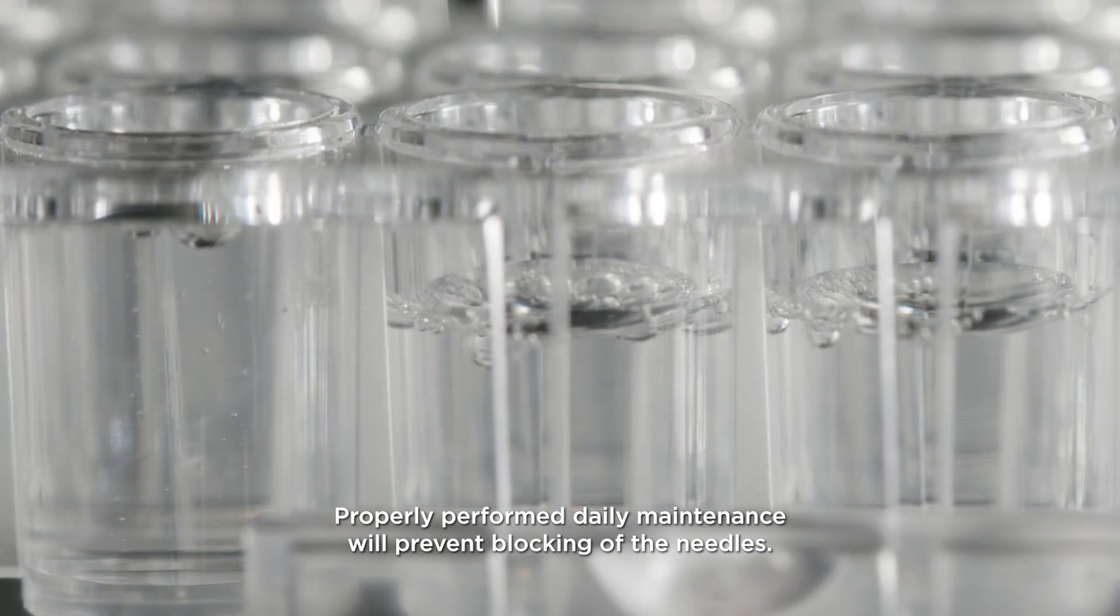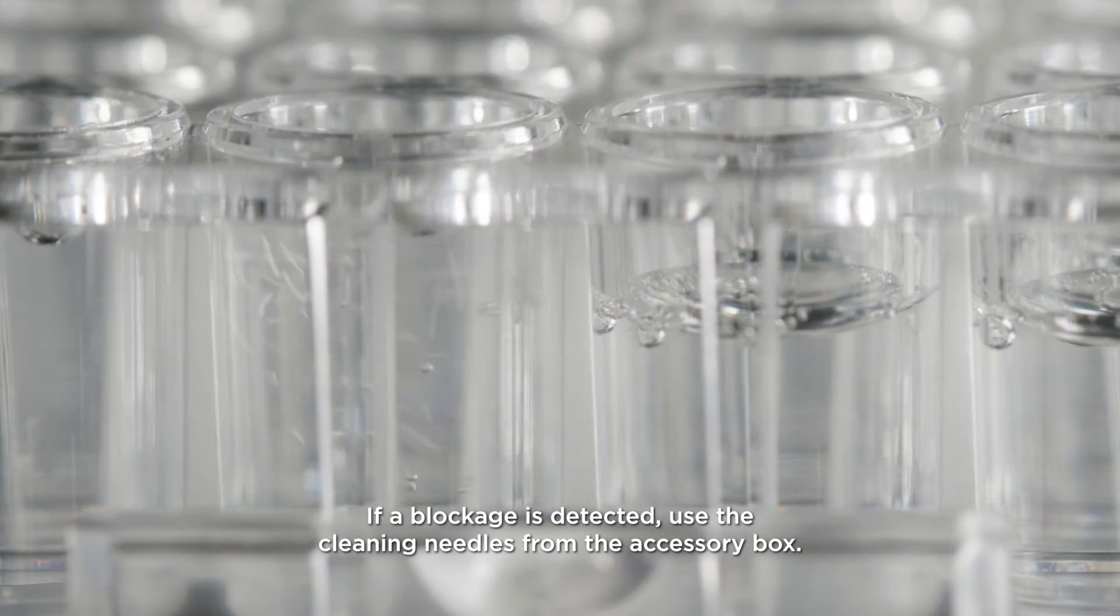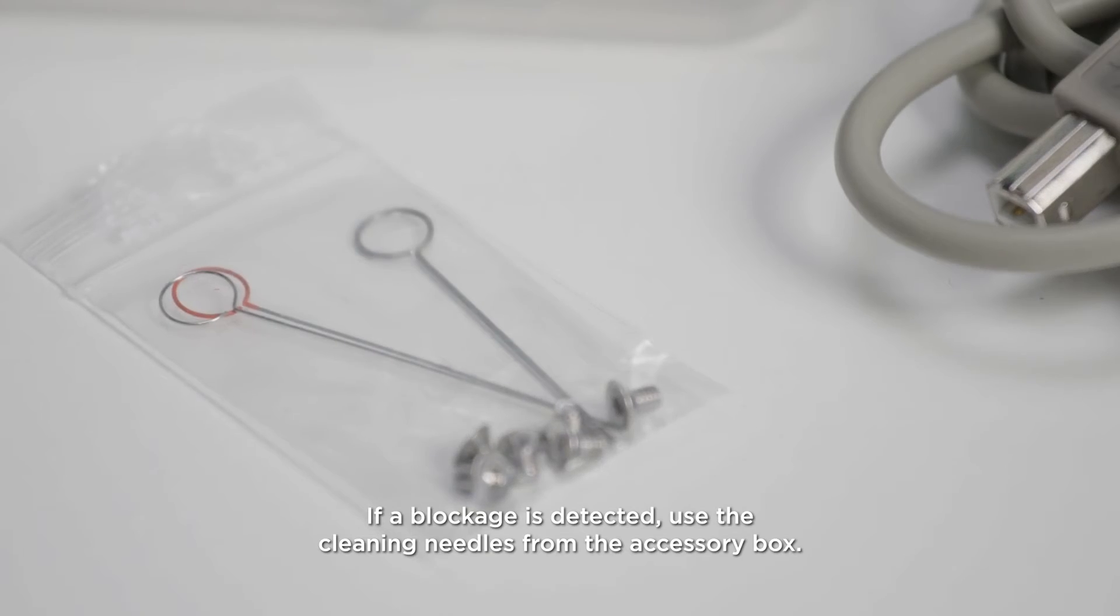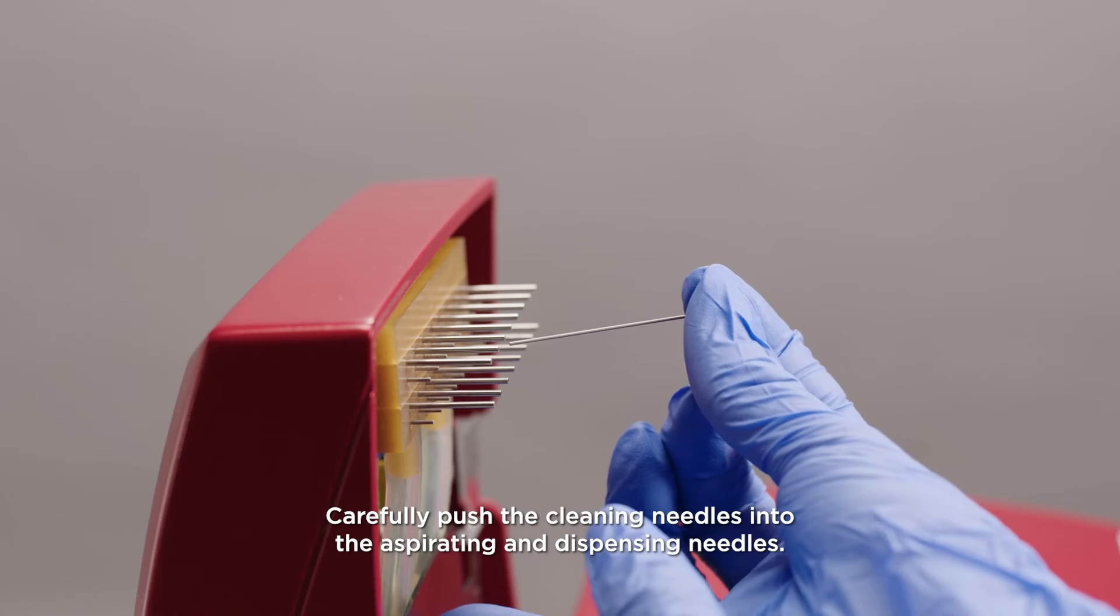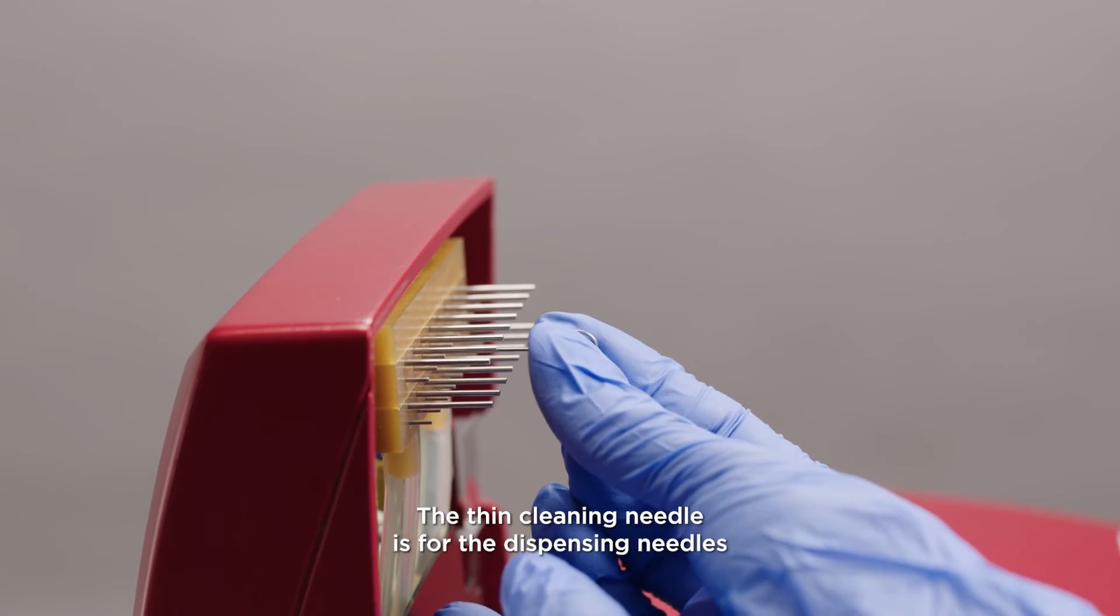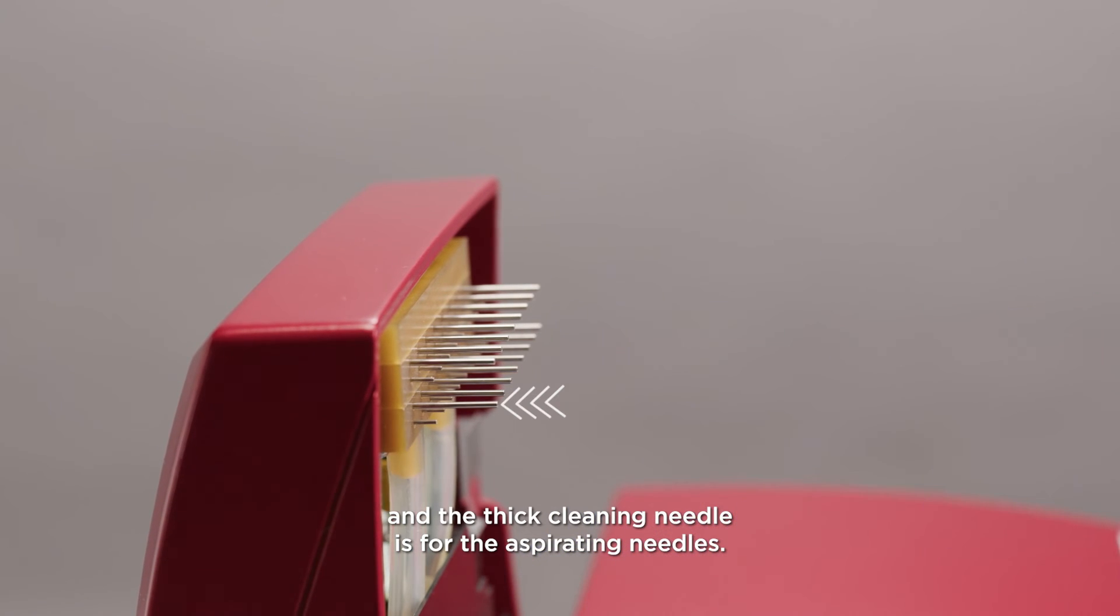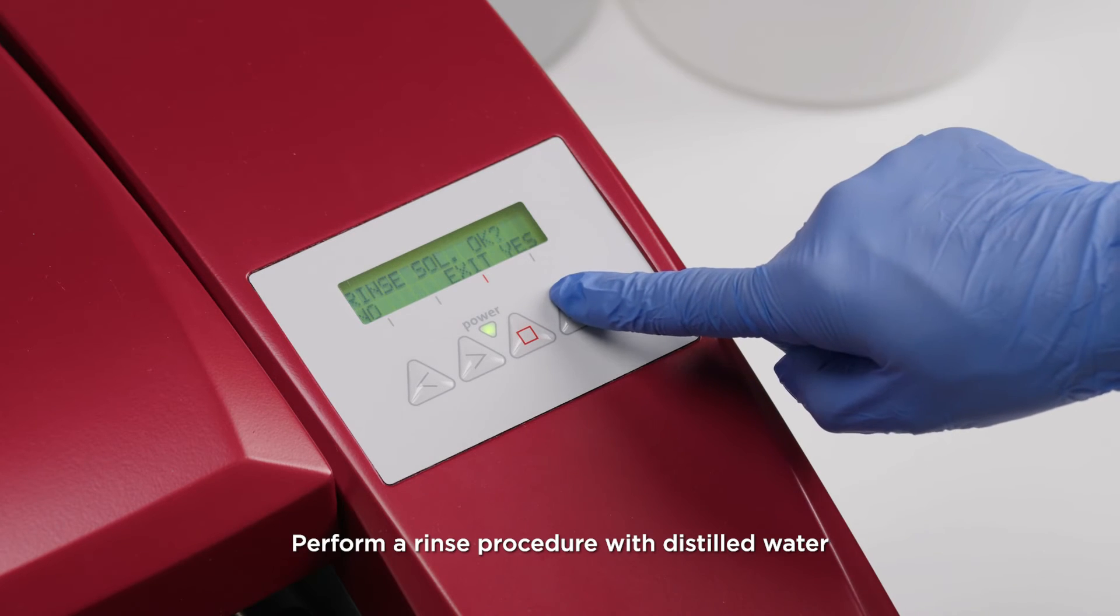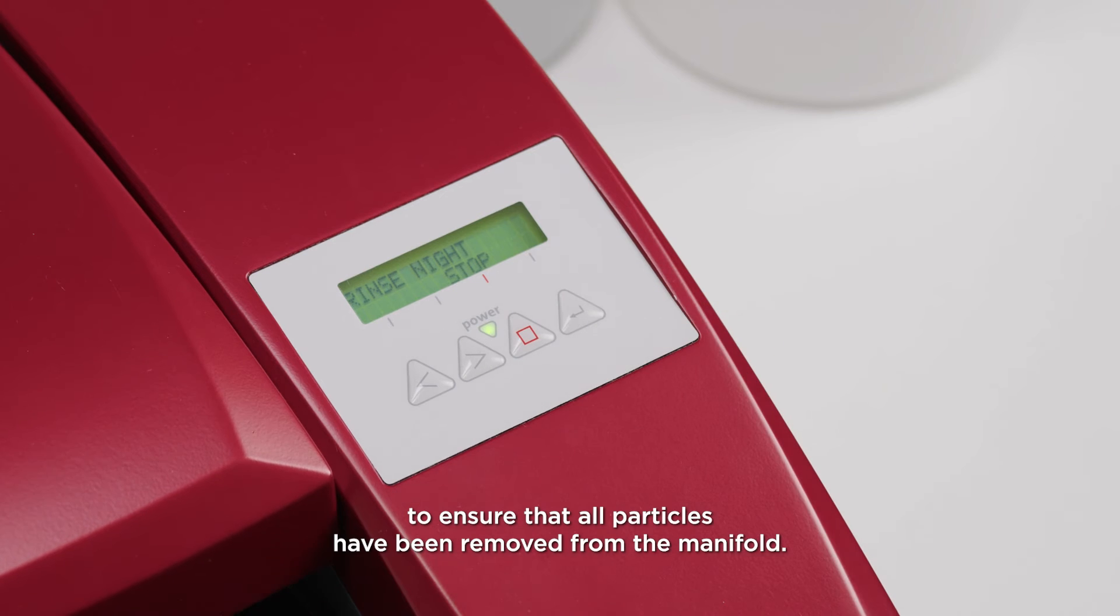Properly performed daily maintenance will prevent blocking of the needles. If a blockage is detected, use the cleaning needles from the accessory box. Carefully push the cleaning needles into the aspirating and dispensing needles. The thin cleaning needle is for the dispensing needles and the thick cleaning needle is for the aspirating needles. Perform a rinse procedure with distilled water to ensure that all particles have been removed from the manifold.